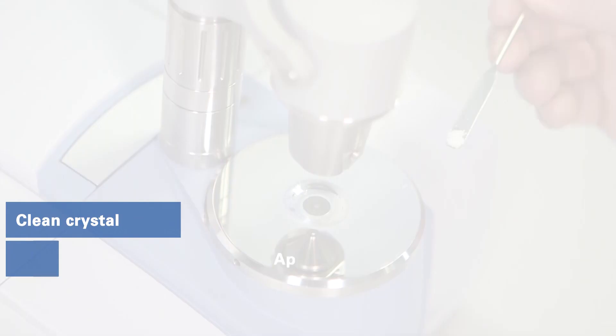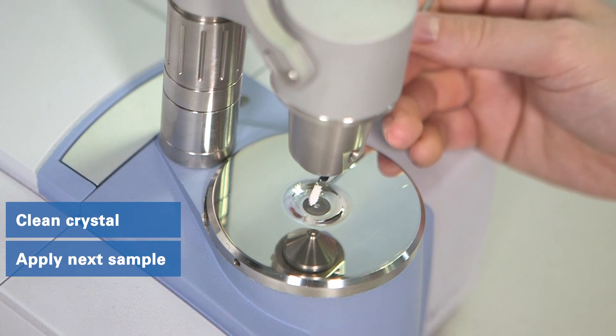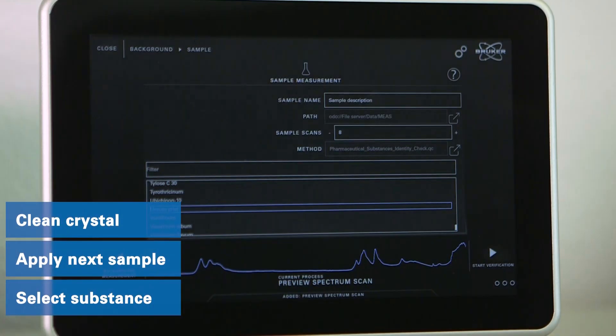First, clean the crystal. Then apply the sample. And lastly, select the appropriate substance.